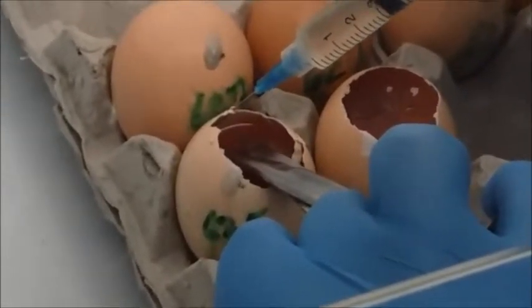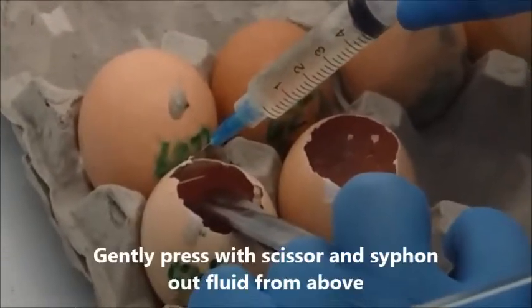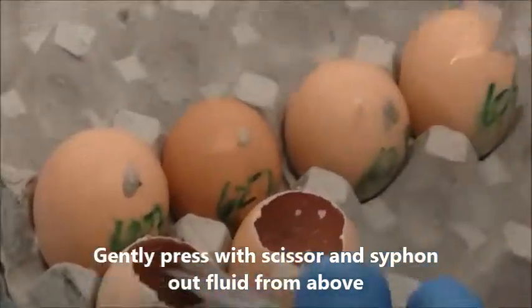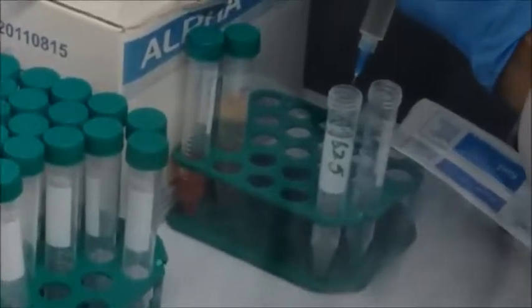You can be patient during the whole procedure. There is no need to rush. As you can see, this egg has a very clear harvested fluid and there is no contamination. Then you put it in the falcon tube for storage purposes.